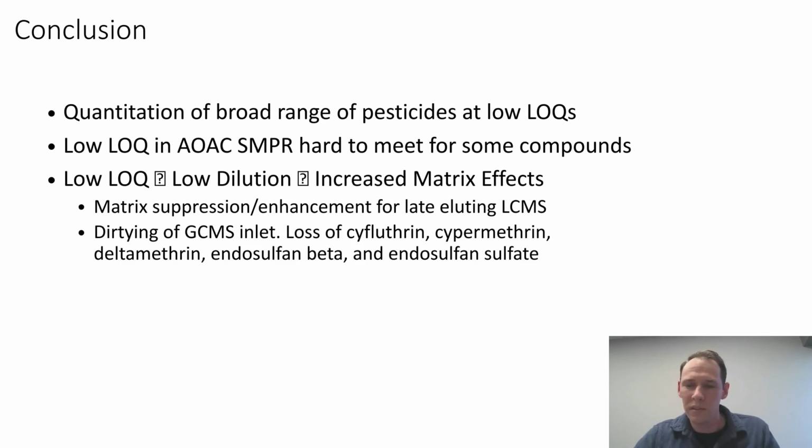So in conclusion, overall, I think that this method is definitely useful for labs wanting to quantitate a broad range of pesticides, meeting various state cannabis requirements. However, there were a few shortfalls in meeting all of the requirements of the AOAC SMPR. And the biggest issue in the method development was the low limits of quantitation for some of the pesticides, which were hard to meet.